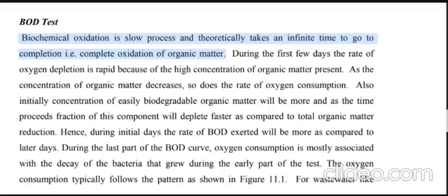So we take the first 3 days or 5 days for the test. We measure how much oxygen is consumed in the first 5 days, because after 5 days there is still some depletion of oxygen, but not that much. The organic matter decomposed by the microorganisms, the rate of reaction is not that much compared to within the first 5 days. Okay, so this is the case. That's why we take a limited time period.